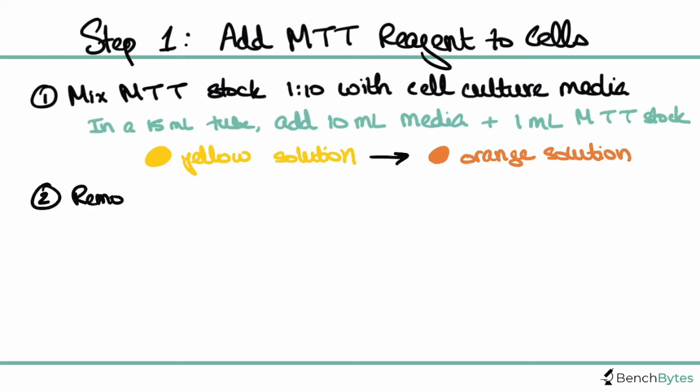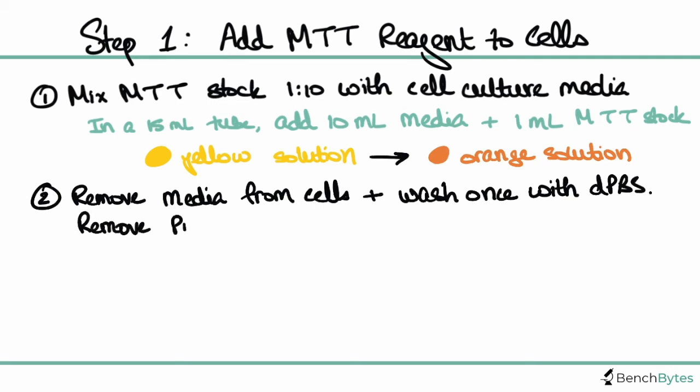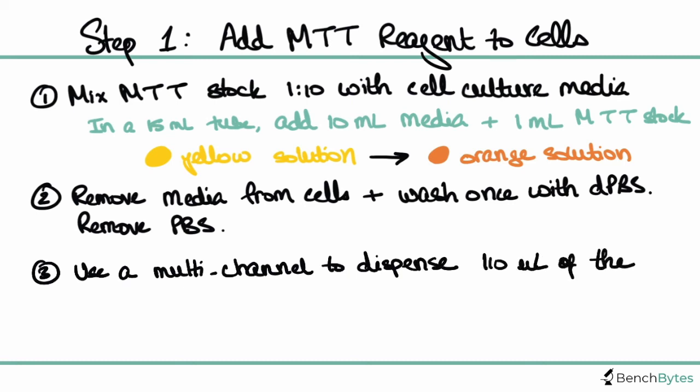You're then going to remove the media from your cells. I like to do this with a pipette up and down just one time to remove any debris that is already on the cells. You can also wash once with PBS and this helps really get rid of any debris or dead cells. You're going to completely remove your PBS from your cells. Then use a multi-channel pipette and a reservoir again because you want to dispense this solution evenly. Add 110 microliters of the MTT plus media solution that you just made into your cells. This is the orange solution, and you want to make sure to dispense it very evenly across your cells.